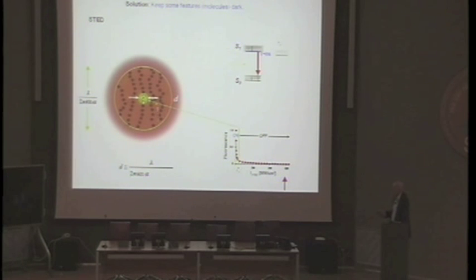Now, it's also clear that resolution cannot be governed by Abbe's equation anymore. So this D now follows a different function. This function is still given by the wavelength, so this is the diffraction limited component. But there is a new term in here.